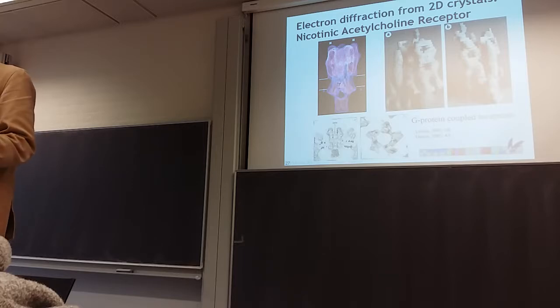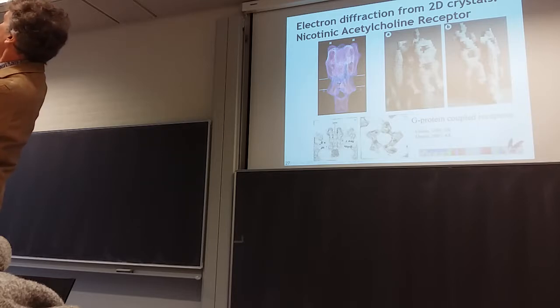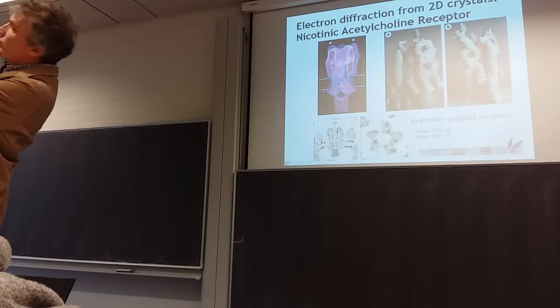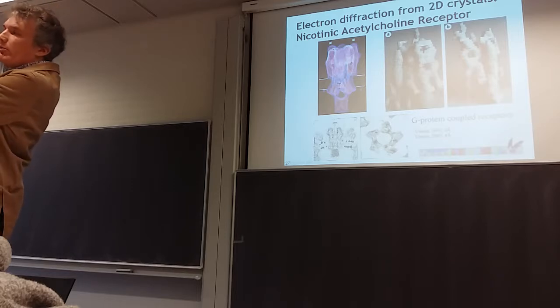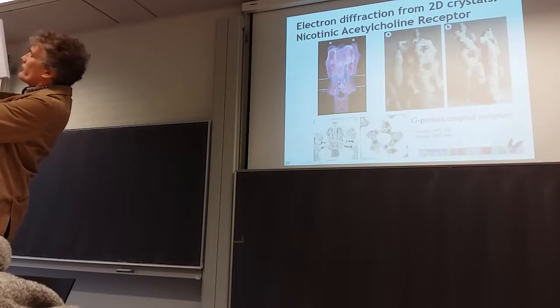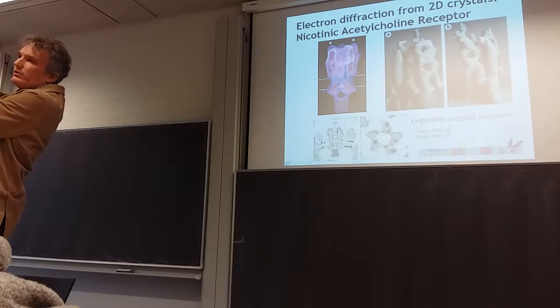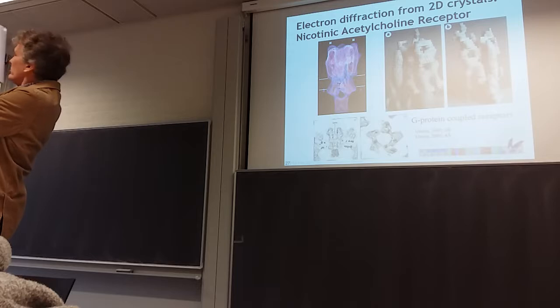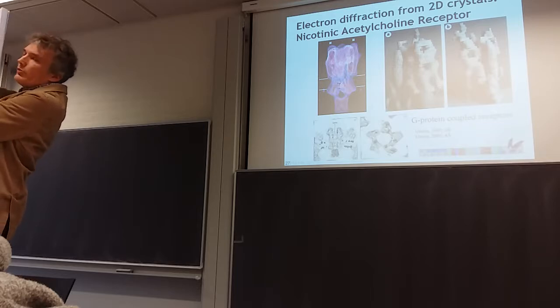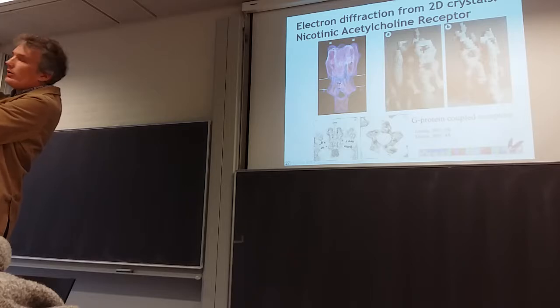Yeah, this one. It's the type 3 secretion system. And you can actually see the two membranes. So this is the bacterial double membrane, which is the inner and the outer membrane. And then, if you look very, very carefully, you can't see it from that distance, but the secretion system is over here. It's a single molecule. And then, if you combine multiple images, you can get an image like this.